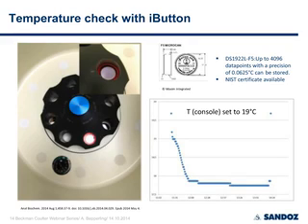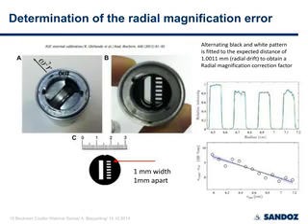What is also quite useful to do, and I'm currently working to get such a radial calibration mask at a machine shop in Germany, is to use a black and white alternating pattern embedded into such a mask, which is inserted like a 3mm centerpiece into the AUC cell.